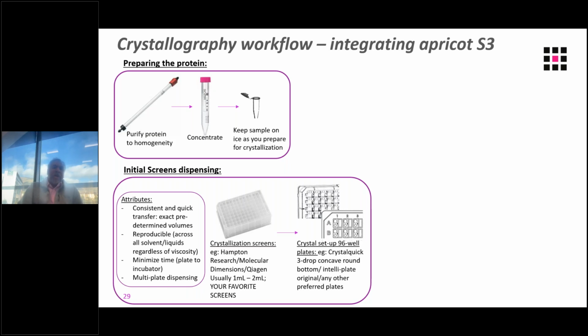We also want to minimize the time, because in not all cases do you have a protein that is really stable and able to sit forever on ice. So considering all these attributes, one of the solutions that I arrived upon was a liquid handling system like the Apricot S3. Next slide, please.